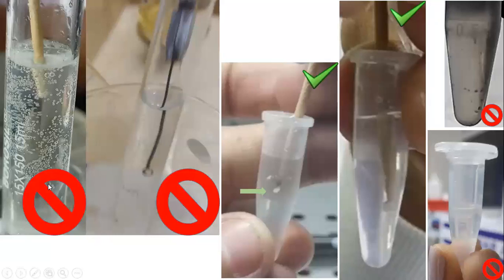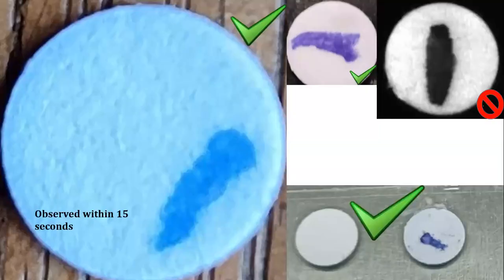Also, when you fill 1%, 3% hydrogen peroxide, make sure it is bubble free. You are going to observe the bubbles from the bacterial biomass. If the tube already has bubbles, it will be very difficult to do so. So make sure they are bubble free. I would say 1 ml of 3% hydrogen peroxide can be used for a maximum of 20 reactions. So 1 ml is very much sufficient. If you are an MSc or BSc student, 1 ml can be used for the entire class, a batch of 20 students.